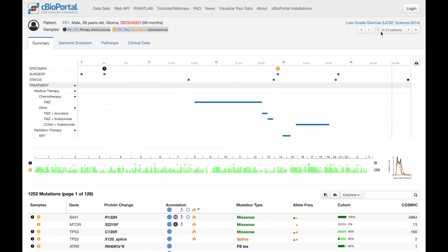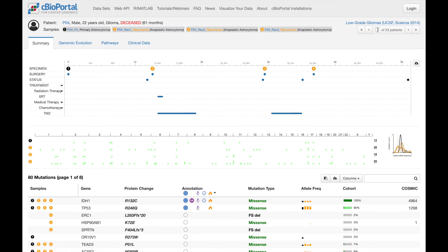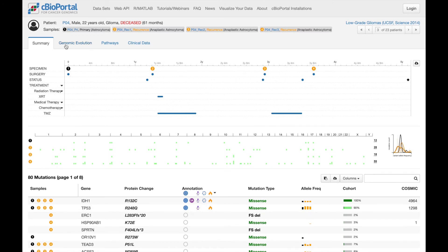Now I'd like to move on to the genomic evolution tab. For this, I'm going to go to one of the other patients in the cohort. And here we see a patient that has four samples profiled.